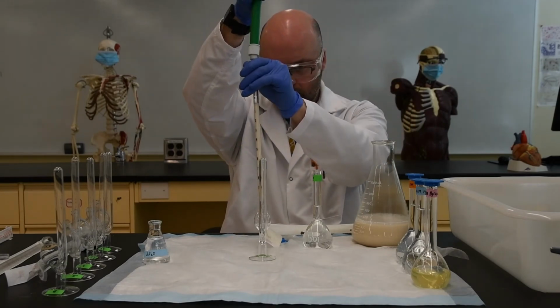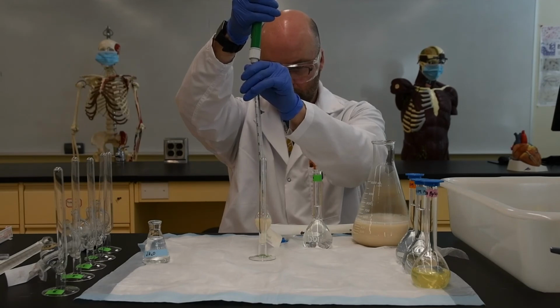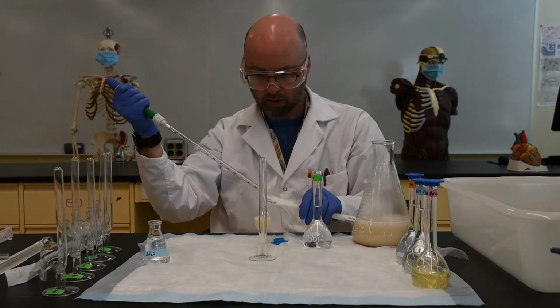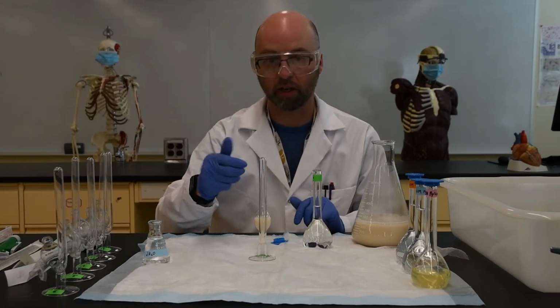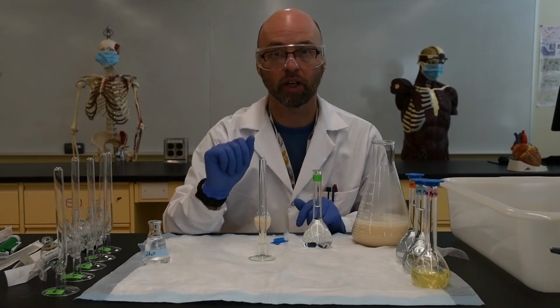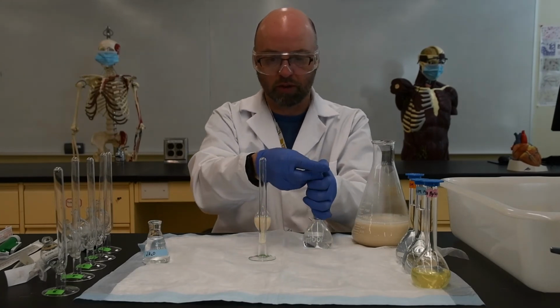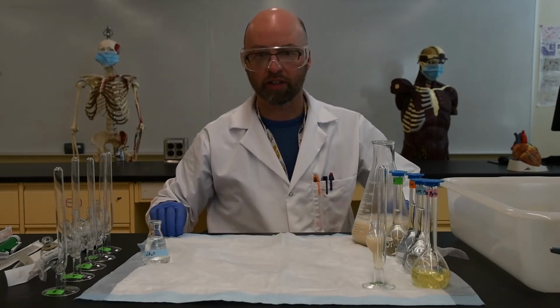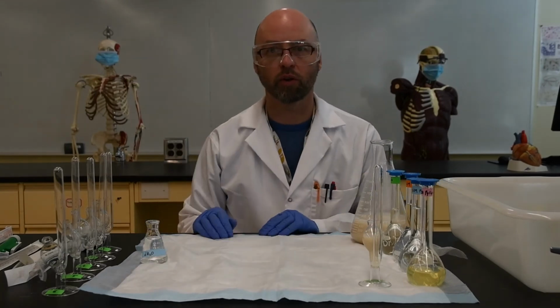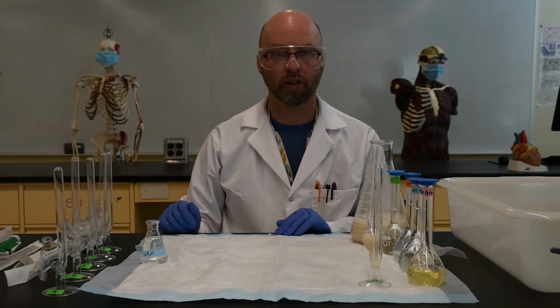Simply add it to the flask like that. So before we start the experiment, I'll invert the flask to get the liquid up into the top, but I won't do that until I've filled all of the tubes. So there's one, and I just have to go and fill the rest of them. So I think what we'll do is we'll fast forward through this step, and we'll see in a second with the 6 tubes ready to go for the experiment.